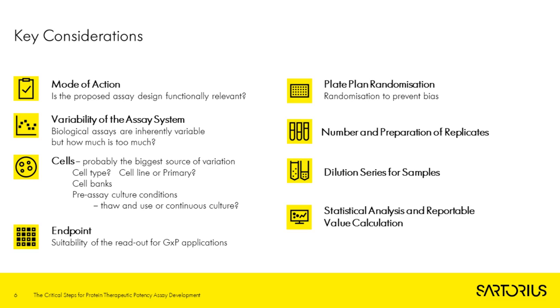The statistical analysis and reportable value is obviously a critical consideration in assay development, but it can also quite often get ignored due to its complexity. As I said earlier, this webinar will not focus on this topic in any depth, other than to say that we need to consider the appropriate curve fitting model for our data. Generally the 4PL is a good place to start for bioassay data, but other models can be assessed for suitability depending on the data. Within our system suitability, we can set requirements for the goodness of fit, or the R-squared value.